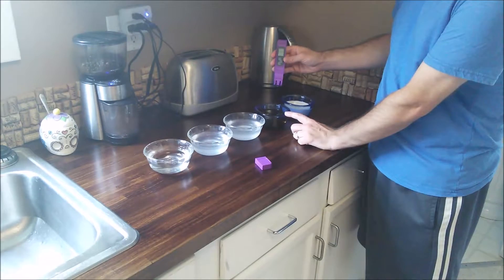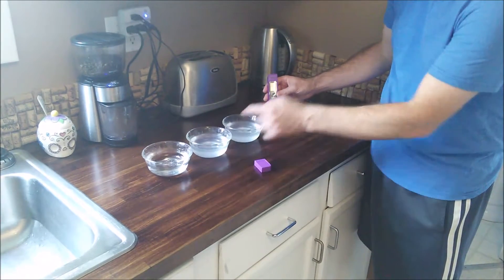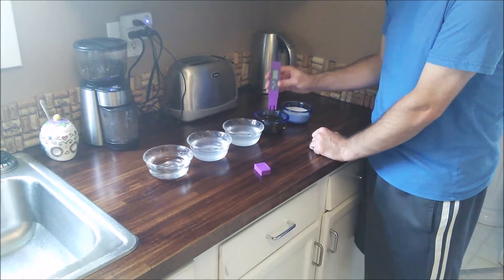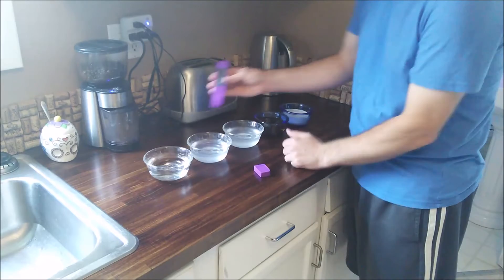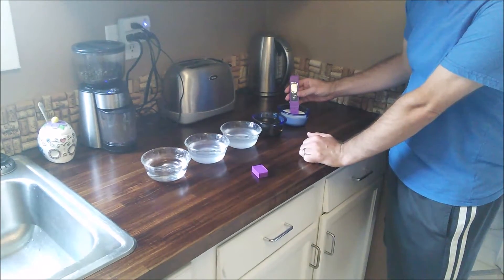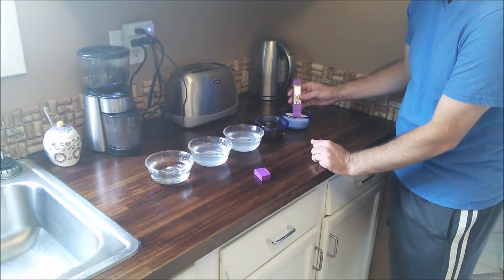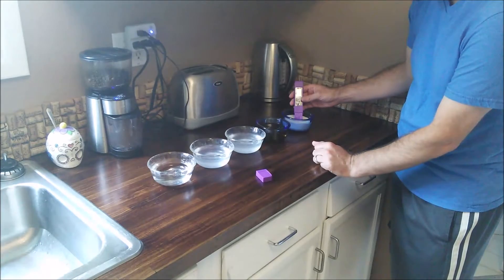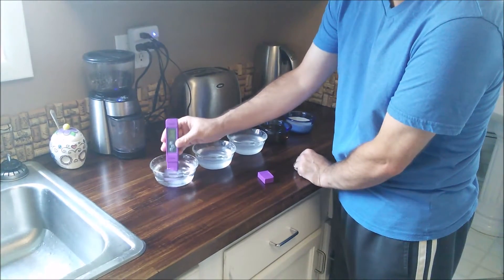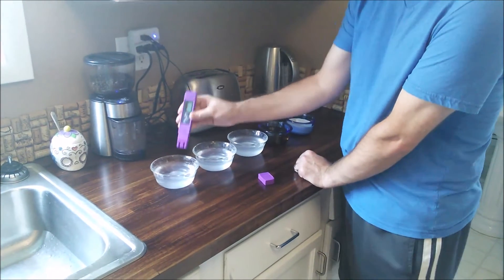Then we have the apple cider vinegar again — electrical conductivity is much, much higher. We had 300 for tap water; this is 2,015 on the scale. So swimming in apple cider vinegar during a thunderstorm is obviously not a good idea. Lastly, a swimming pool full of milk — it's even more conductive at approximately 5,550, almost 5,600 units. So if you are in a thunderstorm and happen to have a swimming pool full of milk, do not swim in it because it is extremely electrically conductive.